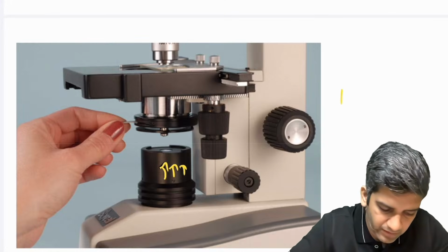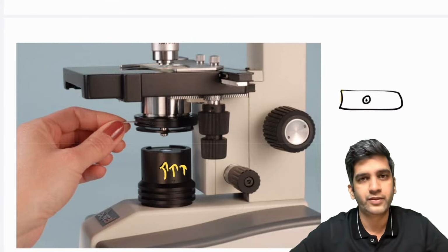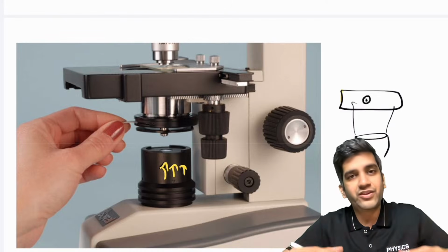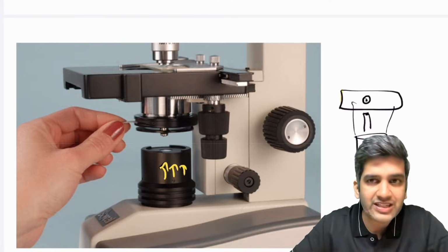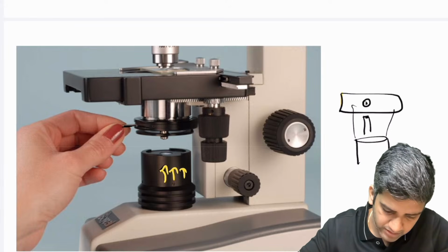But let's say you have a slide of, you must have seen sections of acute appendicitis. You'll have only the specimen here, but the light source will give light everywhere. I don't want everywhere. I want the light to constrict and fall only on this, because everything else is waste for me, right? That's where the iris diaphragm comes in. This person is holding this tiny rod.